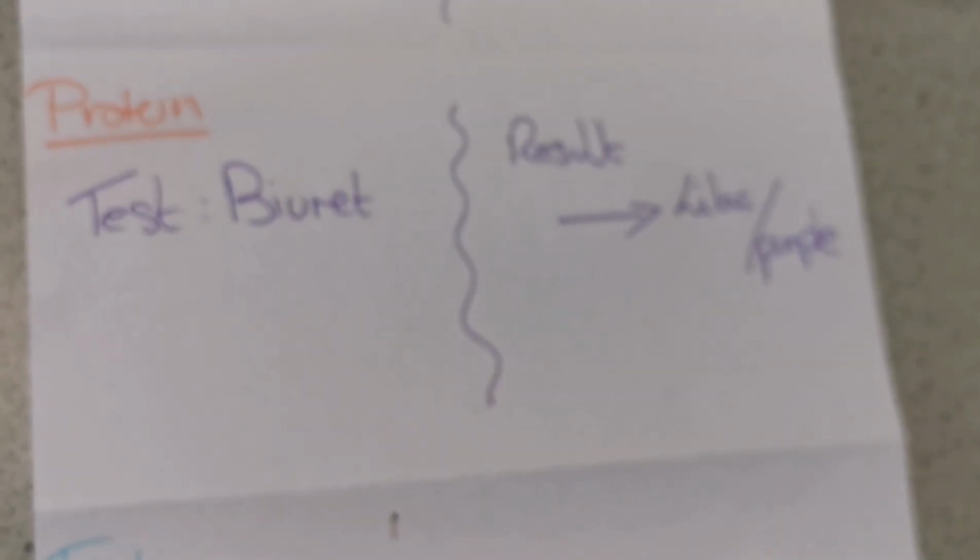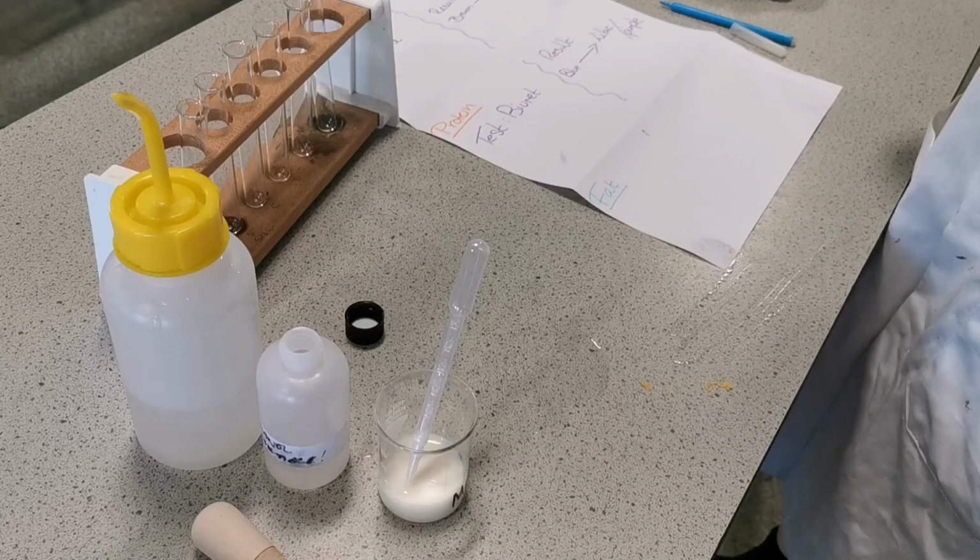Let's focus on that. Why are we not focusing? Hi guys, technical issues. We will make sure this is somewhere as well so that you've got all of these written down. But that is the test for protein.